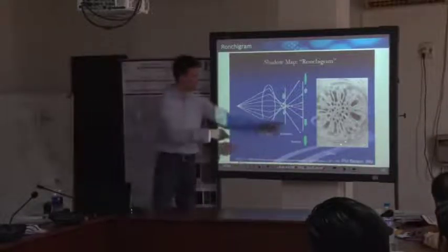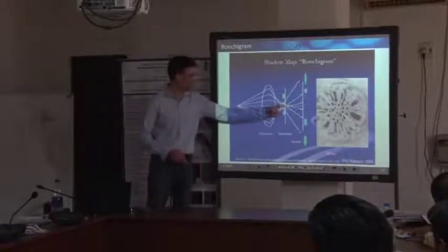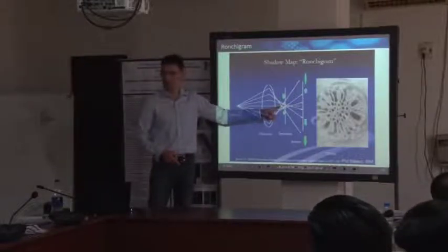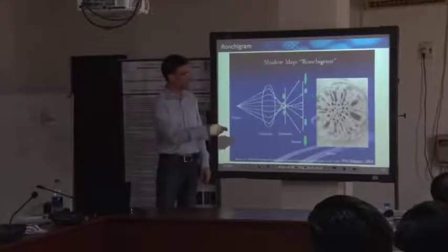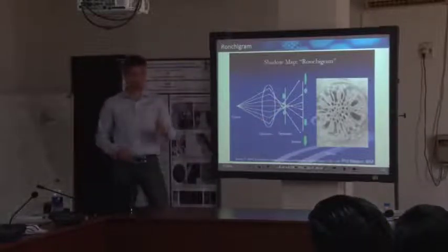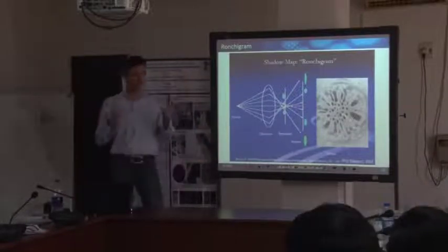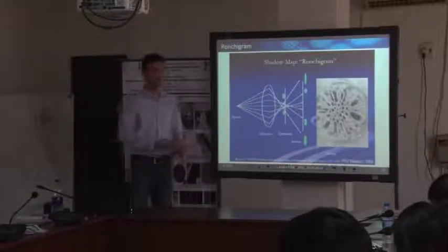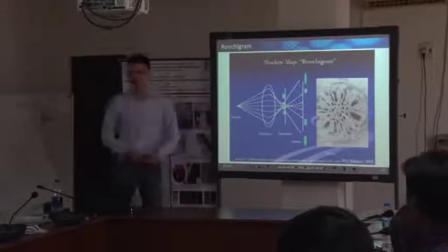And this is what causes this weird contrast in between here. If you overfocus our probe, so if you shift the probe up above our sample and we focus our probe here, then there would not be any inversion. So you wouldn't see these rings for an overfocused probe. When you go from under to overfocus, at least for the inner region of your sample, you get an inversion, or we have mirror symmetry. It's an inversion of the whole image simply due to geometry.